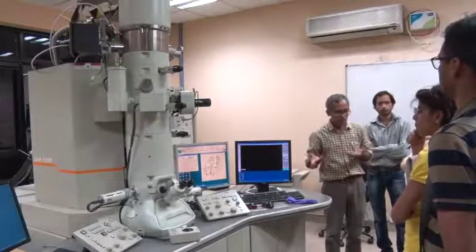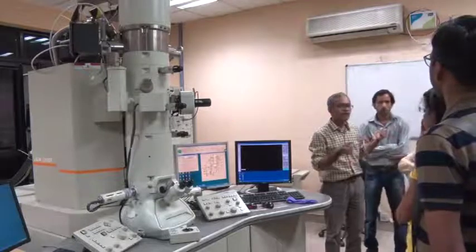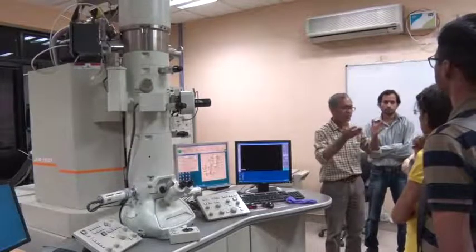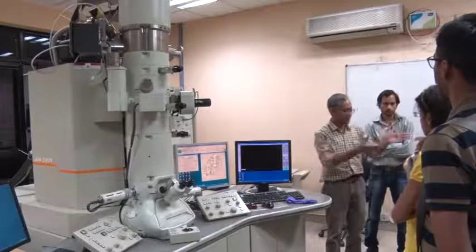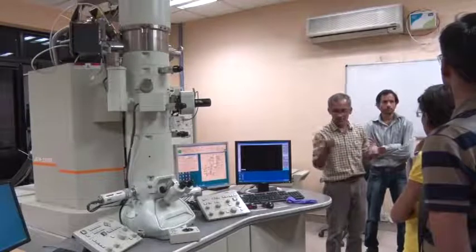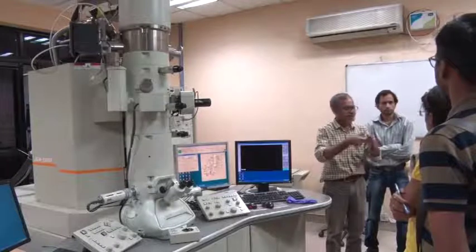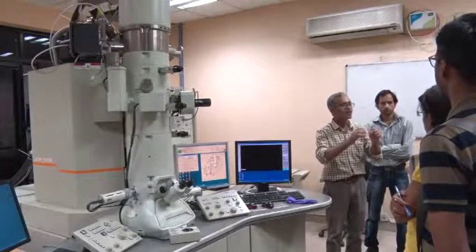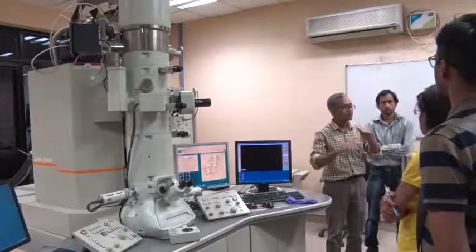And in the microstructure itself, about the aluminium, it's the same aluminium foil which you definitely have come across as packaging foil. So we have prepared, and Ambuj has helped us in preparing that sample. So it's the sample prepared at IUSC. Preparing it is easy because the aluminium foil is already 13-14 micron thick. So no need to do any mechanical thinning.